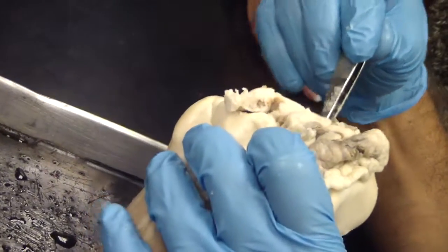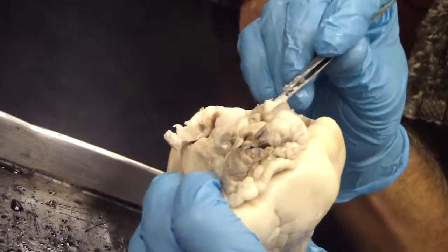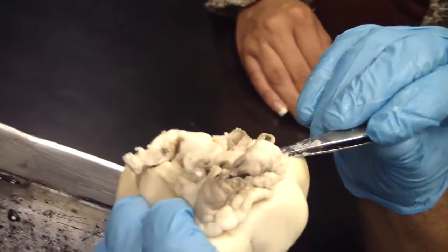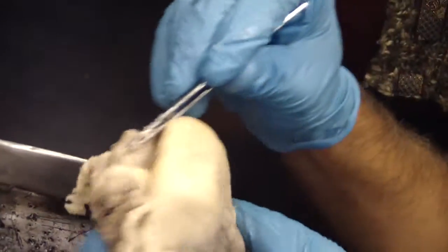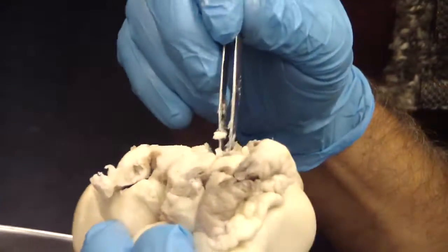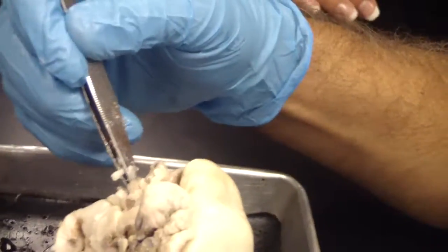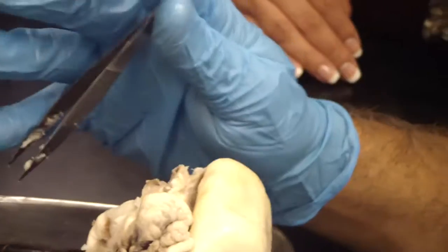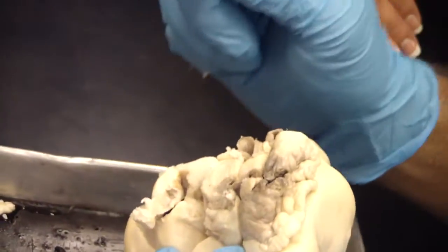Here's the arch right here. What was the first major branch of the arch? Brachiocephalic, and that's the brachiocephalic right here. They have already cut the rest, so you can see up to the brachiocephalic at least.